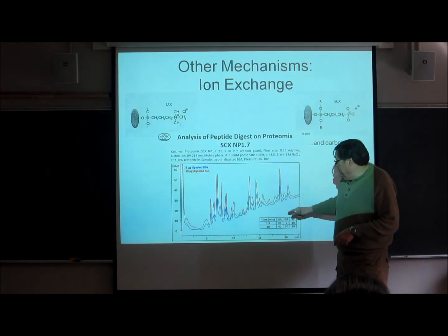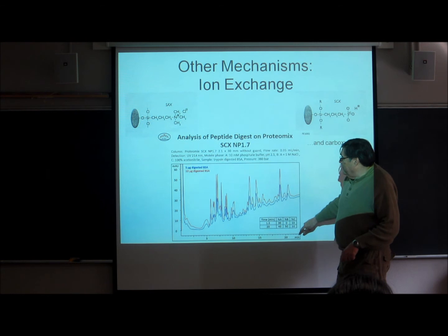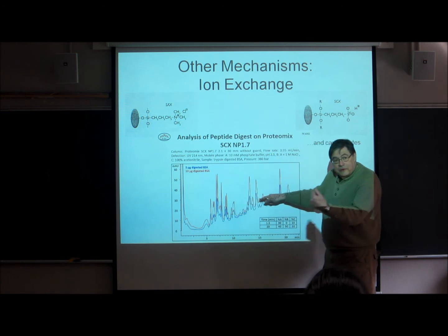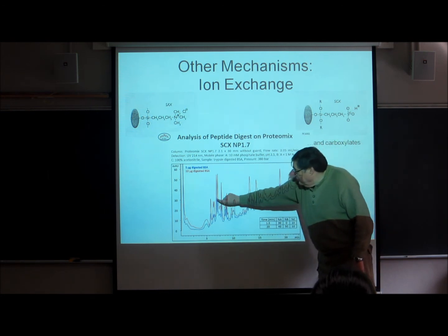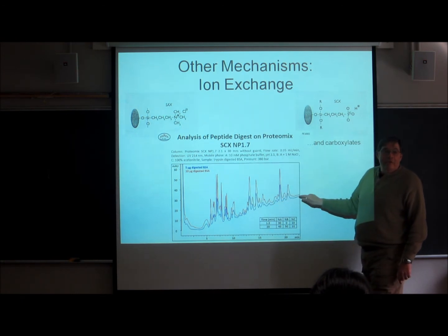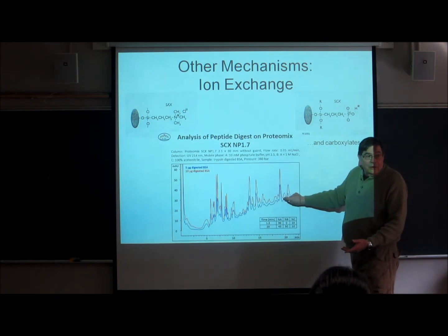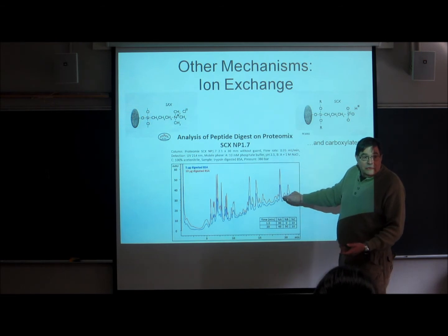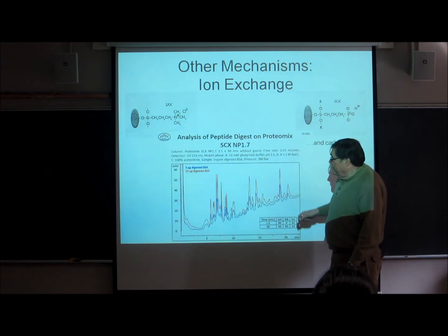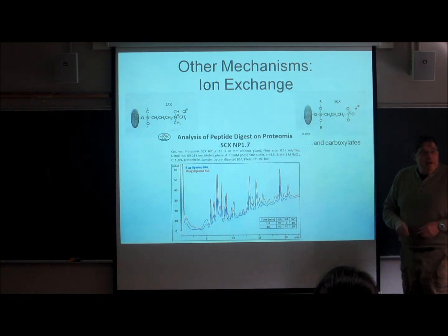Sorry this is so busy, but this shows you 2 different runs. But I think you can see here a 20-minute chromatogram. With the cation exchange, you're getting all these pieces from the original bovine serum albumin out, and you're looking for particular components here. If you can pass this stream on to a mass spectrometer, you can probably get a better idea of what each of these components are. They're oligopeptides or smaller things. Probably dipeptides on the smaller side here. Oligos up in here.